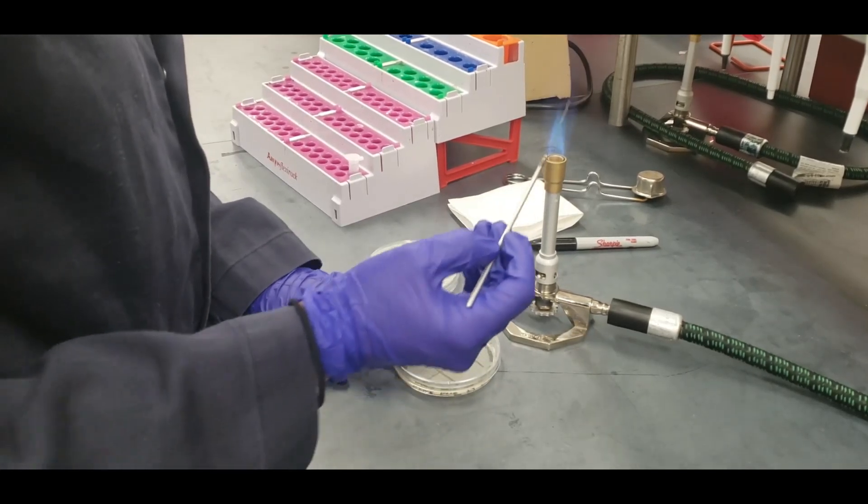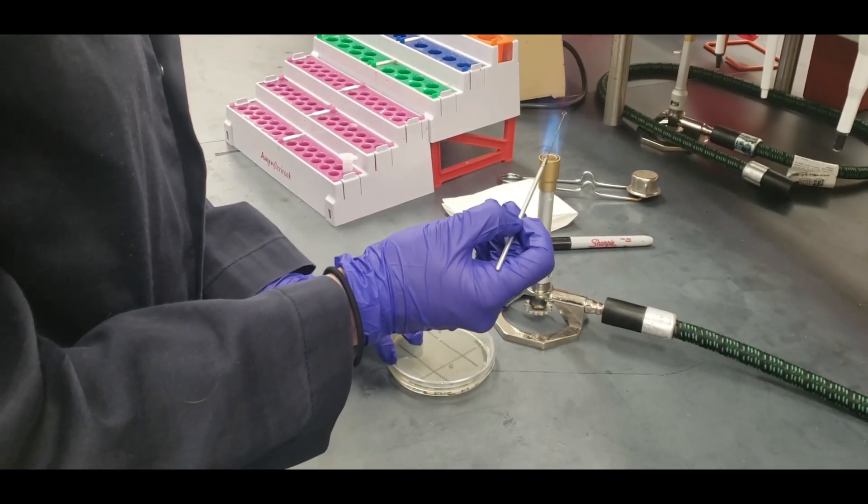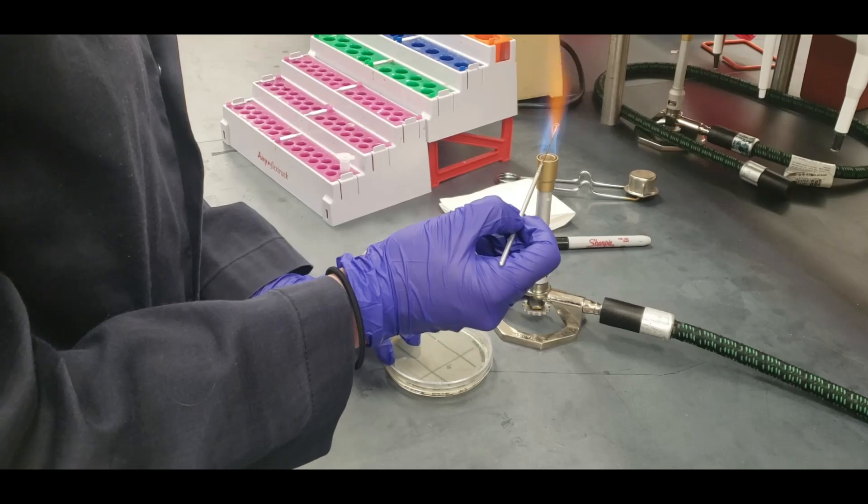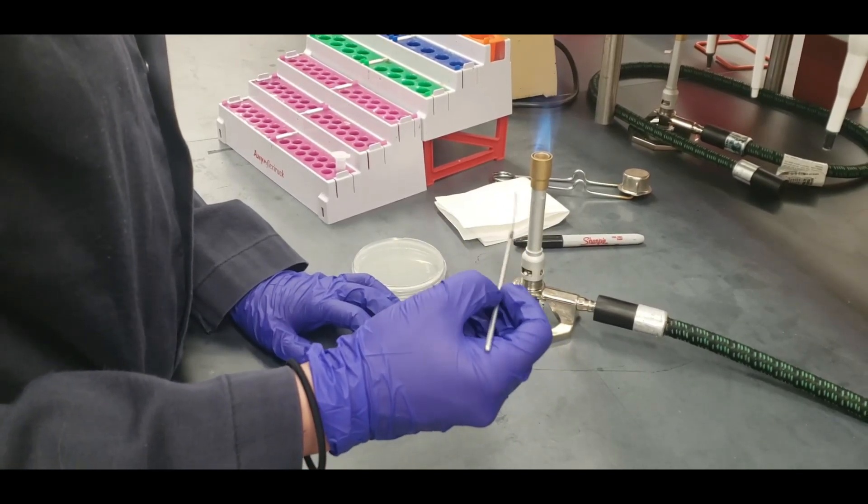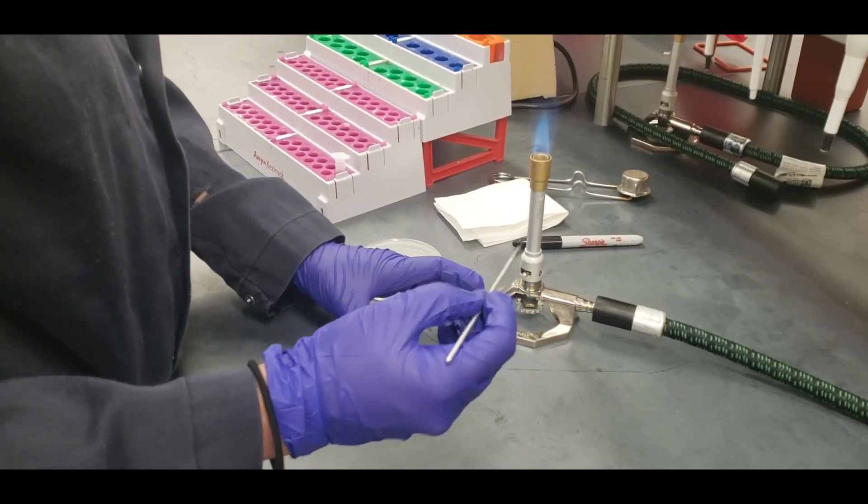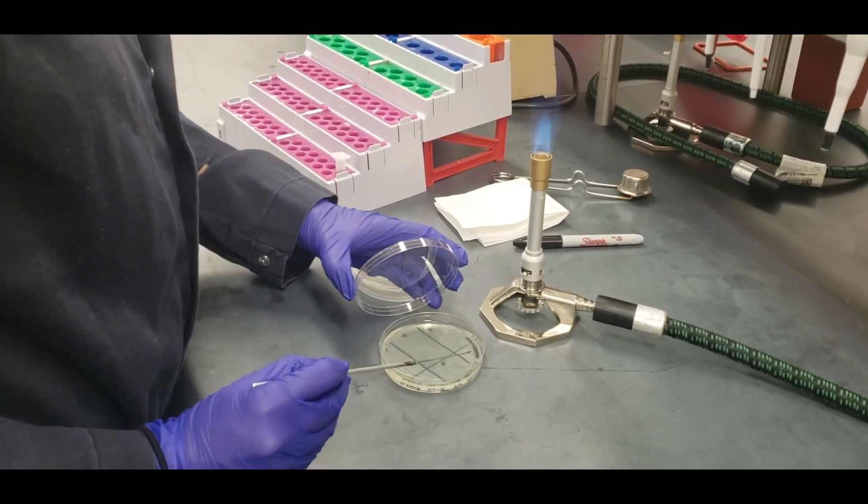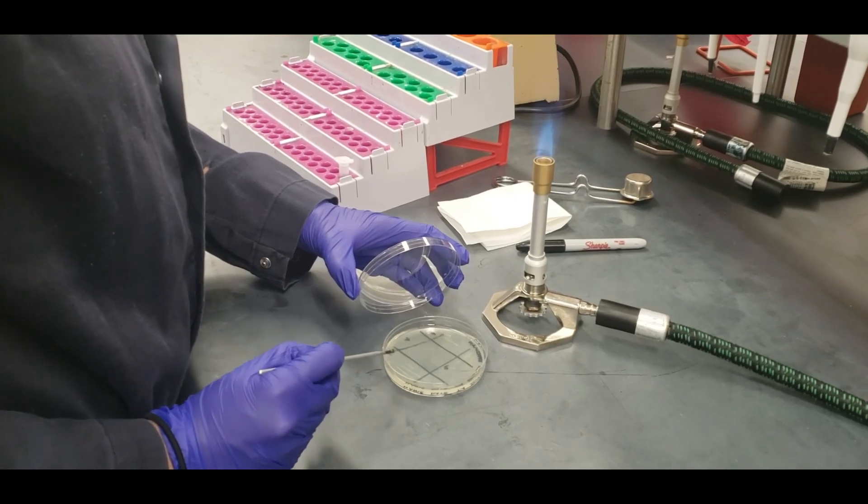After you've streaked all of quadrant two, you're going to flame your loop again, cooling it down. And you're going to pull only one time from quadrant two into quadrant three, streaking all of quadrant three.